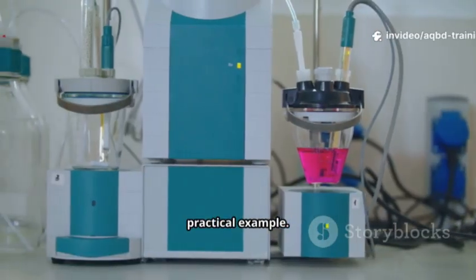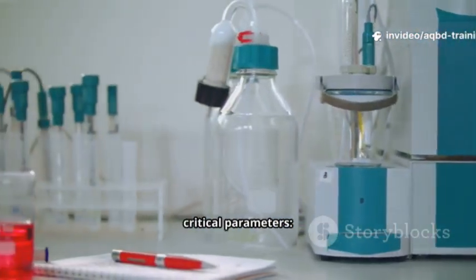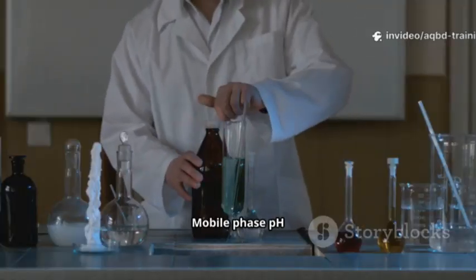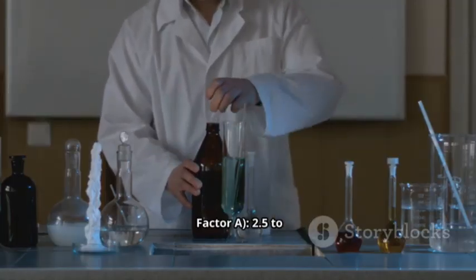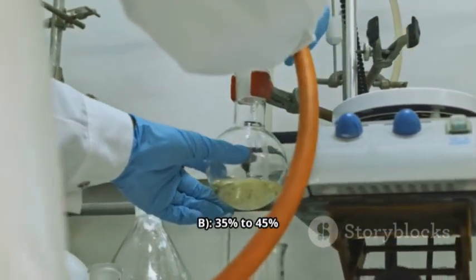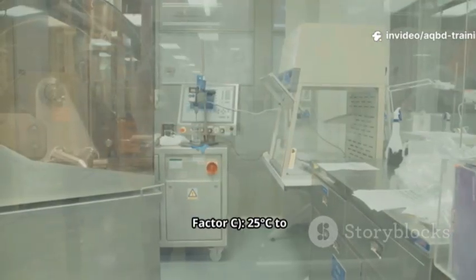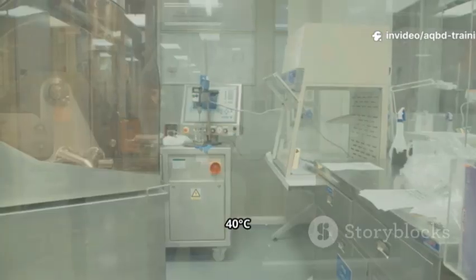Let's look at a practical example. We're developing an HPLC method and have identified 3 critical parameters. Mobile phase pH, factor A, 2.5 to 3.5. Acetonitrile percentage, factor B, 35% to 45%. Column temperature, factor C, 25 degrees Celsius to 40 degrees Celsius.